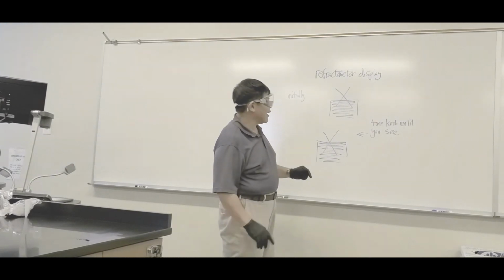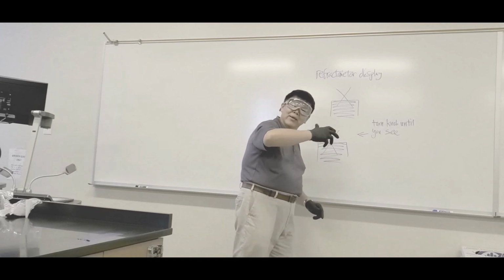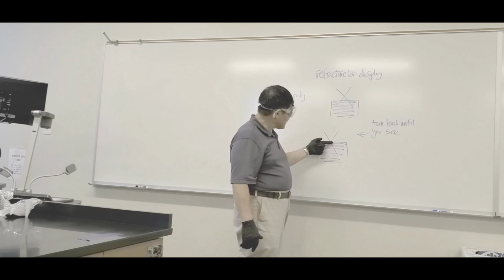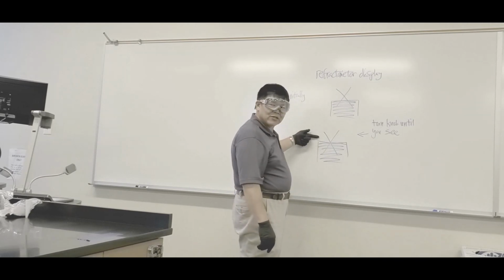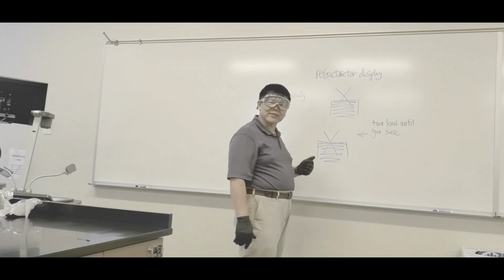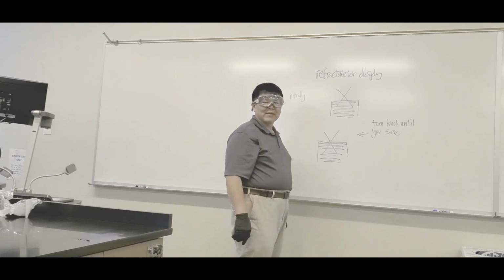Now what you do is turn the knob ever so gently, either way, until you get that interface to hit the center of the X. So you turn the X into a V, yeah? Once you have done that, that tells the refractometer that it's a correct reading. That's when you push, yeah? That's how you do that.